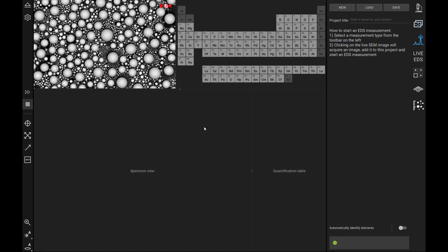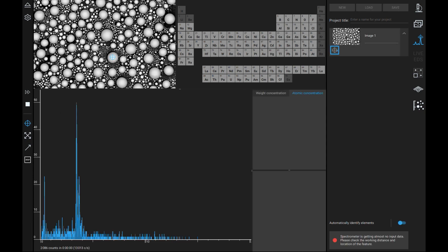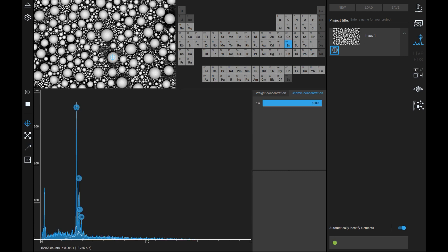Point beam intensity is our second highest beam intensity. It generates an even greater amount of signal than image intensity, allowing for images with much higher contrast. This setting is used primarily for EDS spot analysis, but can also be used for imaging certain materials.